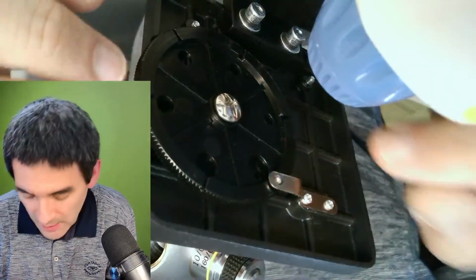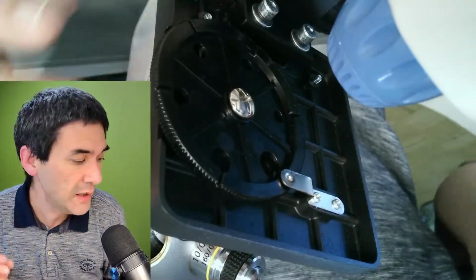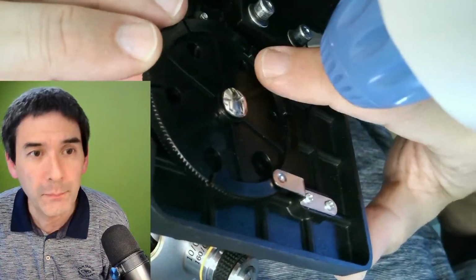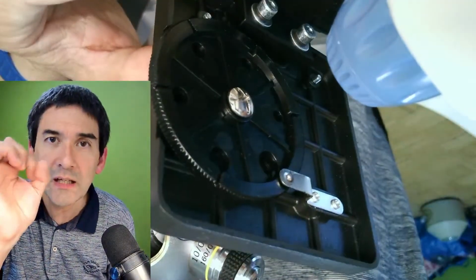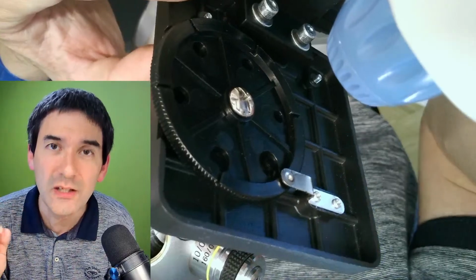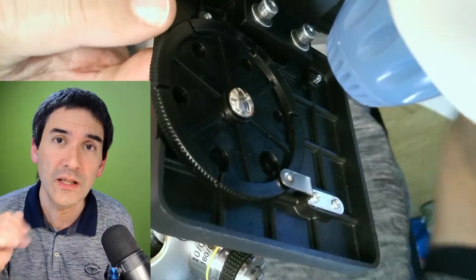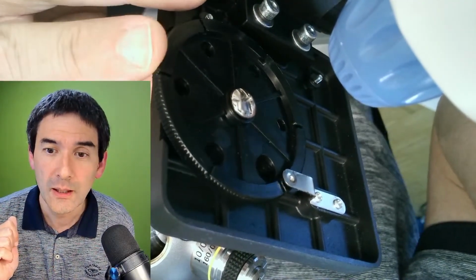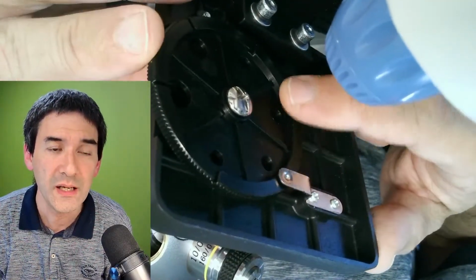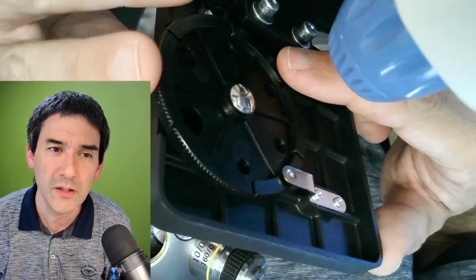So what you can do, if you have a microscope like this, and I have tried that, is take an old credit card or a piece of plastic and make a tiny hole in it, and put it over here to really decrease the aperture. What you're going to see, especially with a 40 times objective, is that you really increase the depth of field. It's going to be significantly darker, but you're actually getting an effect. Some companies also put some color filters in here, which don't have a big effect. So I don't know, these wheels here are not really useful.